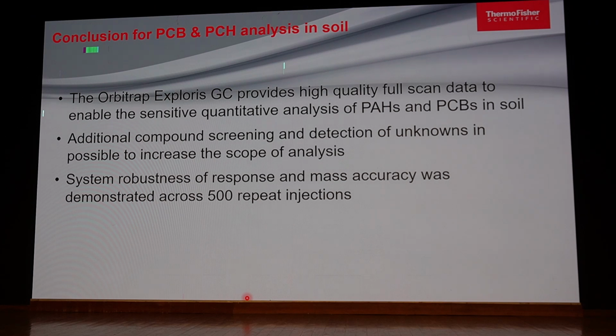Then this is one example for persistent organic pollutants in the case of PAH, PCB in soil. Similarly, you can apply that same approach for other commodities also, like marine products. A similar application you can utilize for PAH, PCB, even dioxin analysis. Dioxin requires some specific sample preparation, and the chromatographic criteria are a little bit different than PAH, PCB. Otherwise, you also need to take precautions very cautiously, because they require specific sample preparation area also.